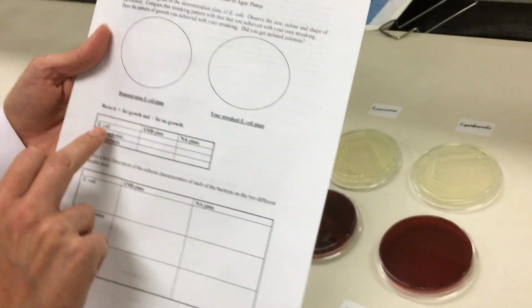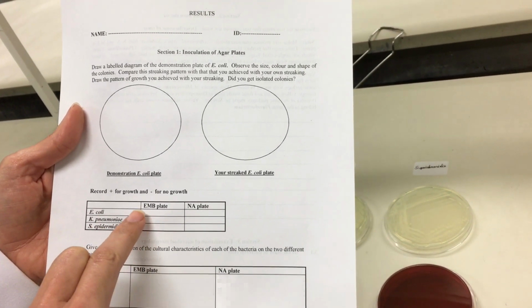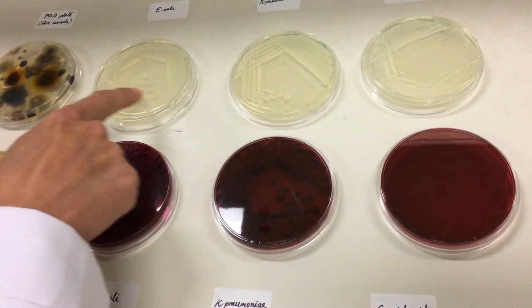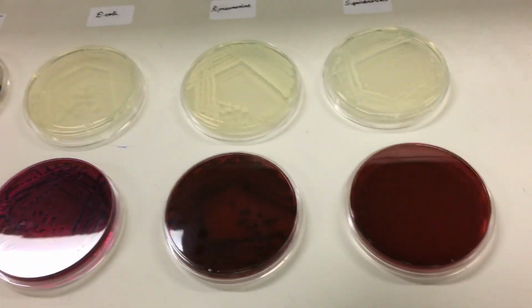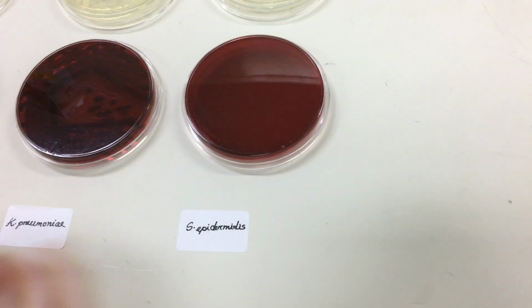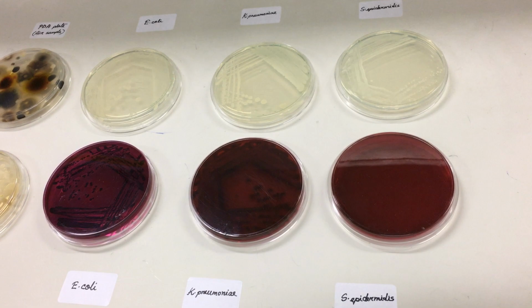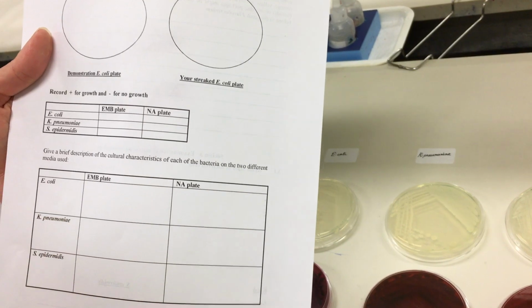For the second section, you're supposed to fill the table for the selected bacteria on EMB plate and nutrient agar. As you can see, they all grow. Sanjida, you can go close. So they all grow, except the Staph epidermidis on EMB. You can see there is no growth on this plate. So you're expected to find out what is in the EMB which doesn't let this gram-positive bacteria grow. So you just refer to positive if it grows and negative if it doesn't grow.